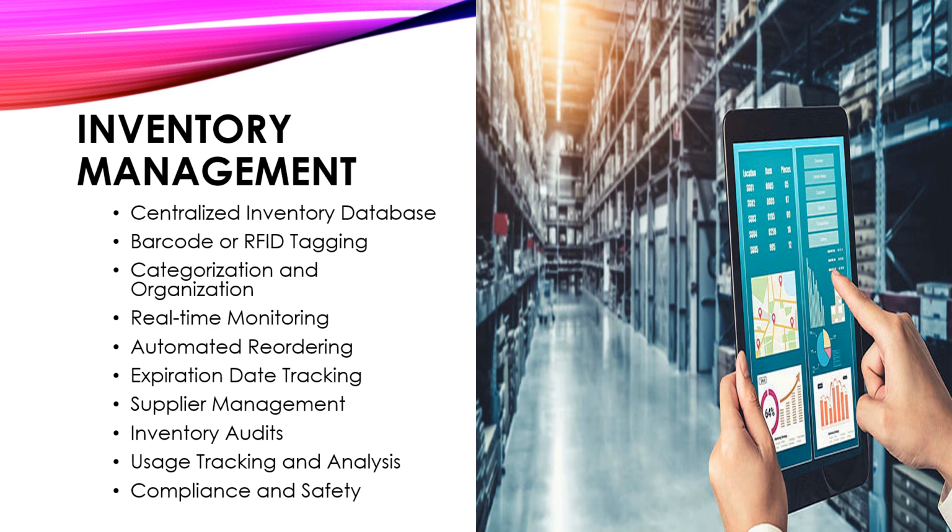Supplier management. Maintain a database of approved suppliers and regularly review vendor performance in terms of pricing, quality, delivery, and reliability.